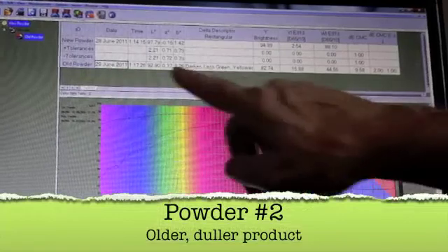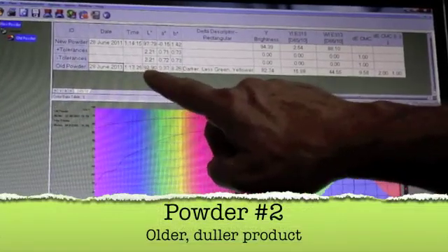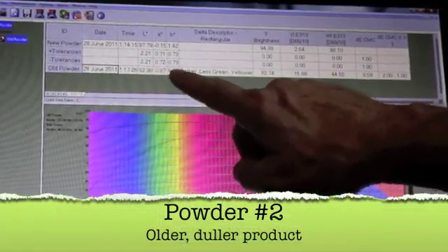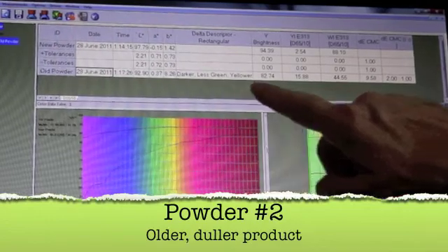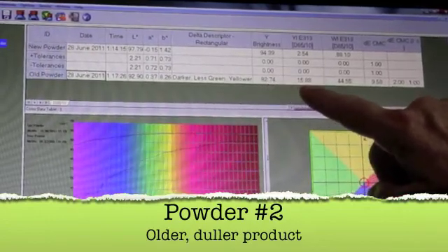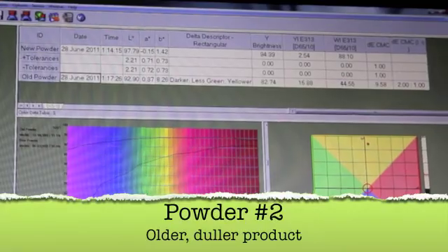And our second product is much darker, with the lightness values dropping, the B value increasing, which is our yellowness. Our brightness has dropped, our yellowness has increased, and the product is much less white.